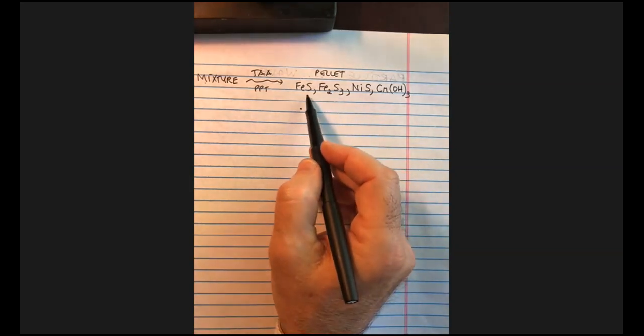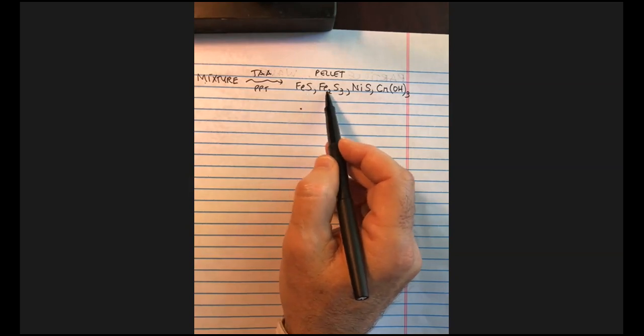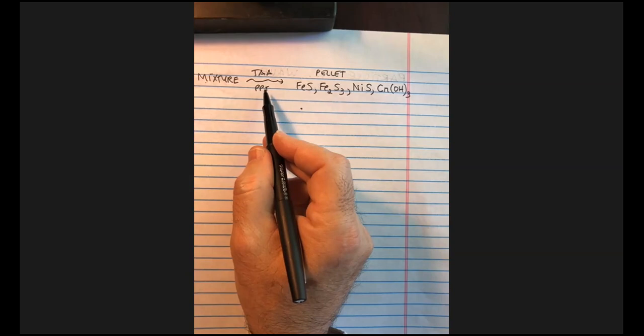And as a consequence, we had a pellet that had the iron sulfides of both the +2 and +3 irons, the sulfide of nickel, and then chromium hydroxide. Remember, the supernatant of this step is what we used to analyze for group 4.